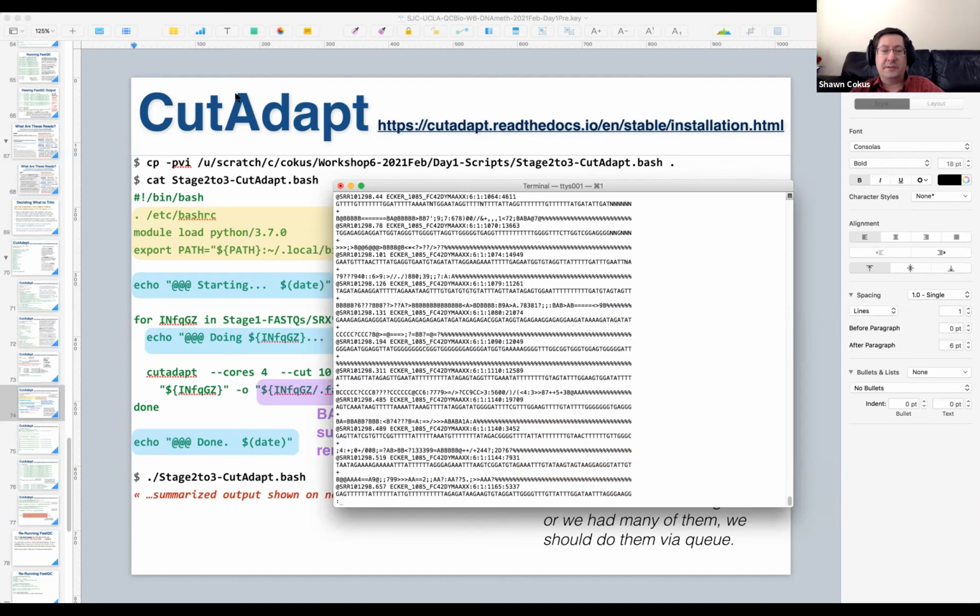So let me just grab. So I'm assuming you've all seen Fastq files before. So basically, there's an @ sign, some read name, possibly with extra metadata. Then there's the actual ACGT sequence, and we've got some Ns in this one. This is the actual read, 5' to 3'. Then there's on a separate line a plus sign, and then there's the per base quality scores, which are really integers from 1 to like 30 or 40 like we saw, but they've been encoded in single ASCII characters.